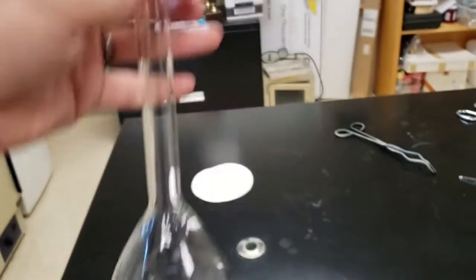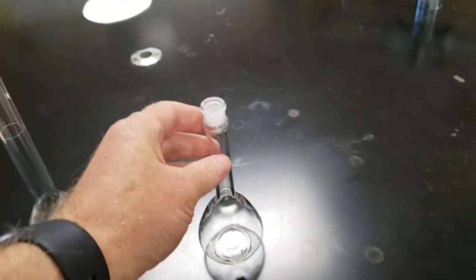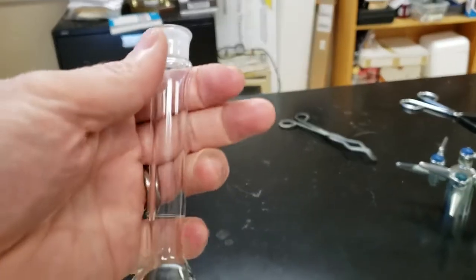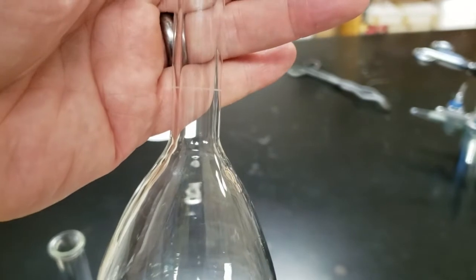You put some distilled water in there, put in the mass of whatever you want to dissolve, dissolve it and fill it up. But they're made for making solutions, not for storing chemicals. So once you make them, you move them away.